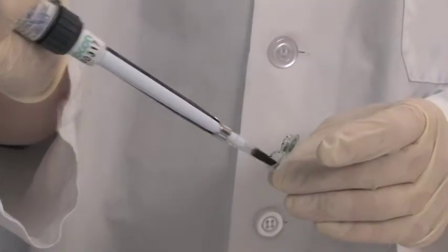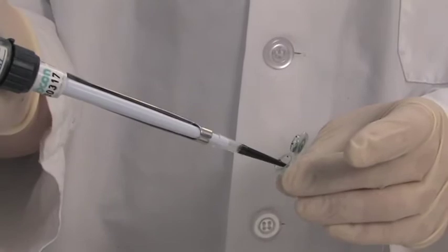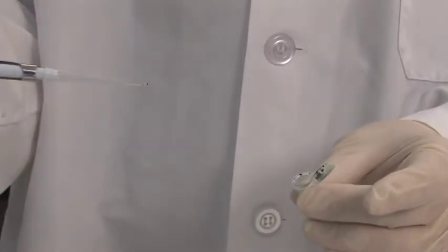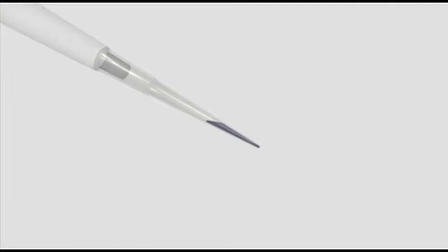SuperSlick tips help you significantly reduce this loss and maximize your sample. LabCon SuperSlick tips have up to 10 times less surface binding than ordinary pipette tips.